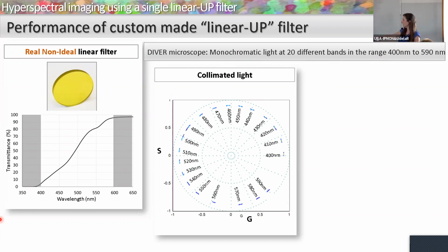As you can see here, all the different bands appear well separated in the phasor plot. You see just a line, which maybe looks different from what you have seen about spectral phasors, but remember I said that now we don't have sensitivity to the width of the spectrum and the modulation is fixed. That's why they appear in that way in the phasor plot.